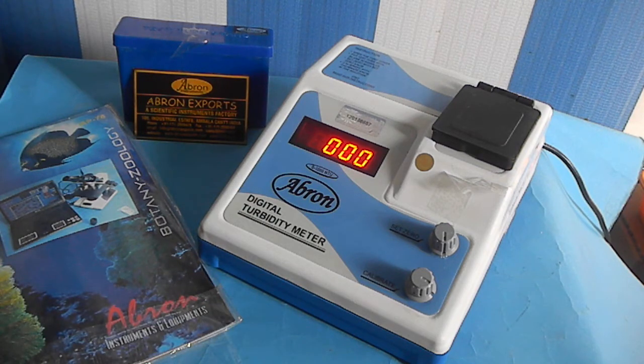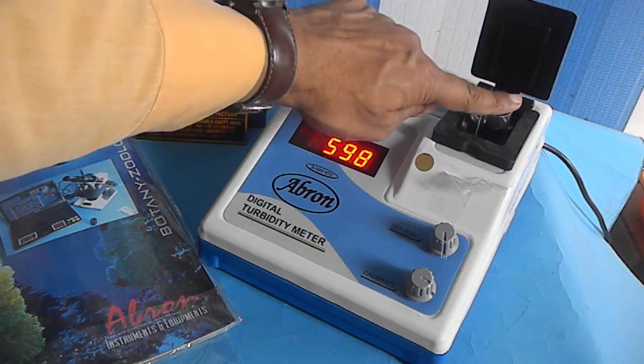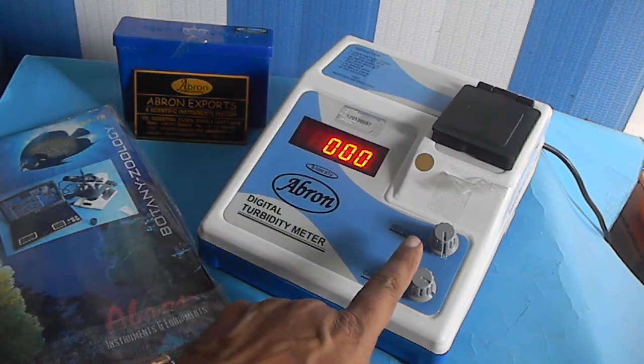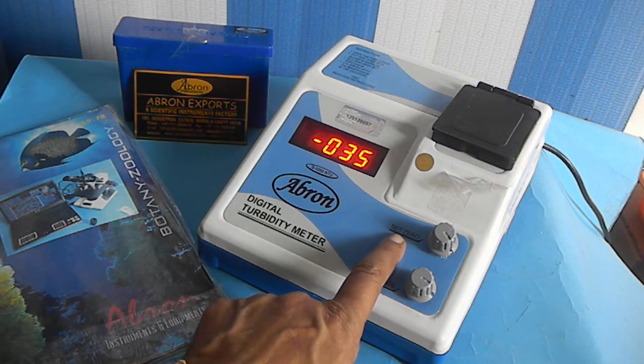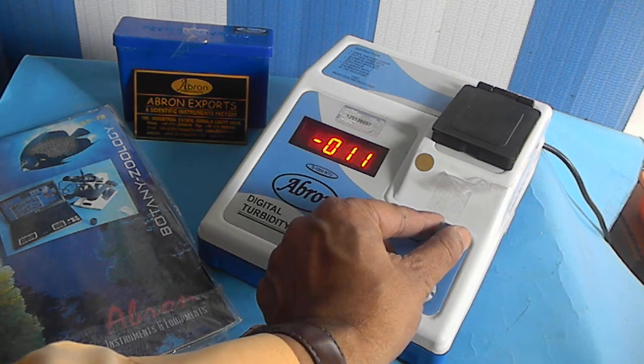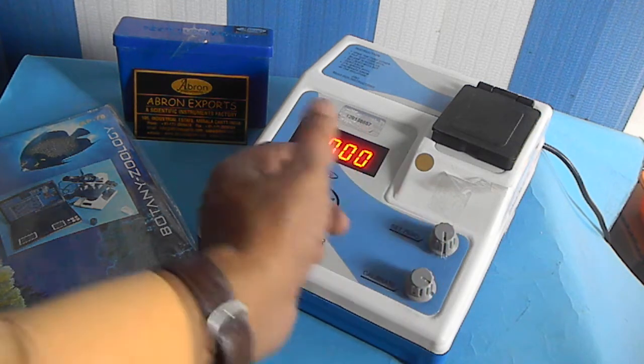To calibrate, first of all there is one test tube — you put distilled water in it, place it here, and set the zero using this set zero knob. It is very easy to do. This is it — it becomes zero.